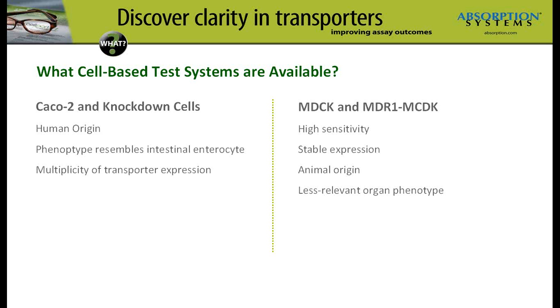These derivatized cells are patented with a reduced expression level of some selected efflux transporters, including P-glycoprotein (PGP), breast cancer resistance protein (BCRP), and the multiple drug resistance protein (MRP2). These cell lines, in origin, were from human colon carcinoma cell lines.